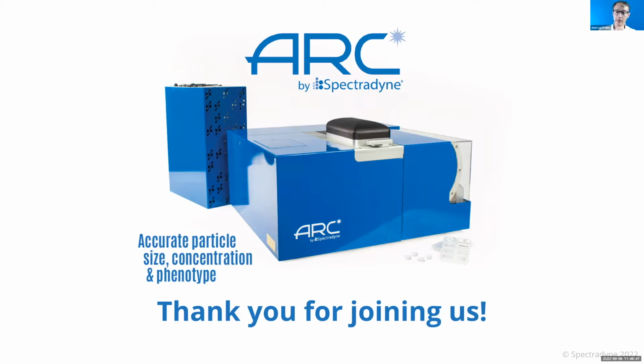Sorry, I have another question, Jean. Yeah, sure. Can you export data to FCS files, which is the flow cytometry standard? We have an export that is not quite FCS format.